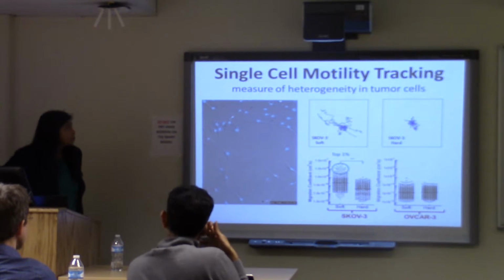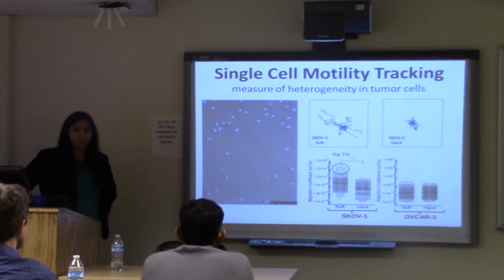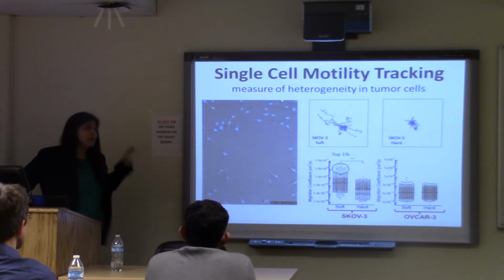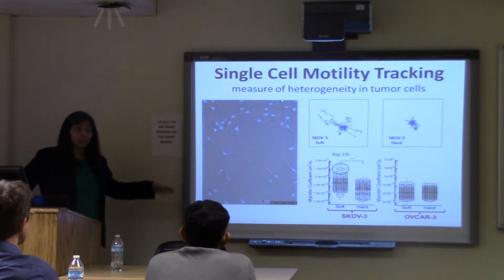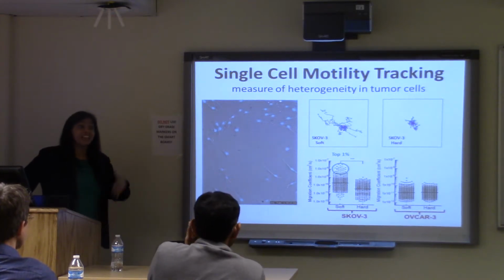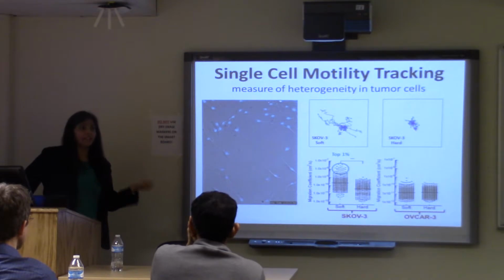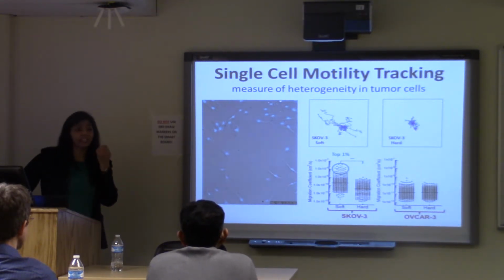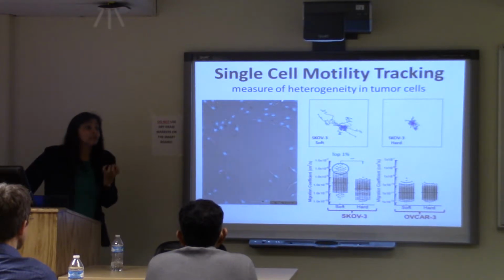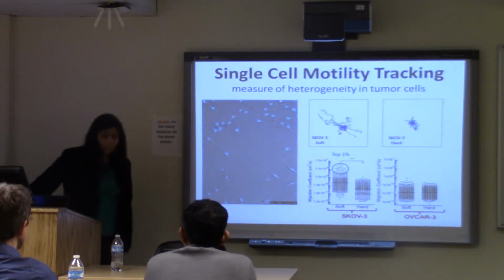And so in terms of tracking cells, this is a really powerful tool that we use all the time. One thing that's great about it is we can simultaneously track hundreds of cells for 8 to 10 conditions, and then use that to determine how the cells move in control conditions, and then how they move after some chemical is introduced, or after they've undergone some sort of physical change. And so this gives us an idea of whether or not certain things lead to increased motility in cells.